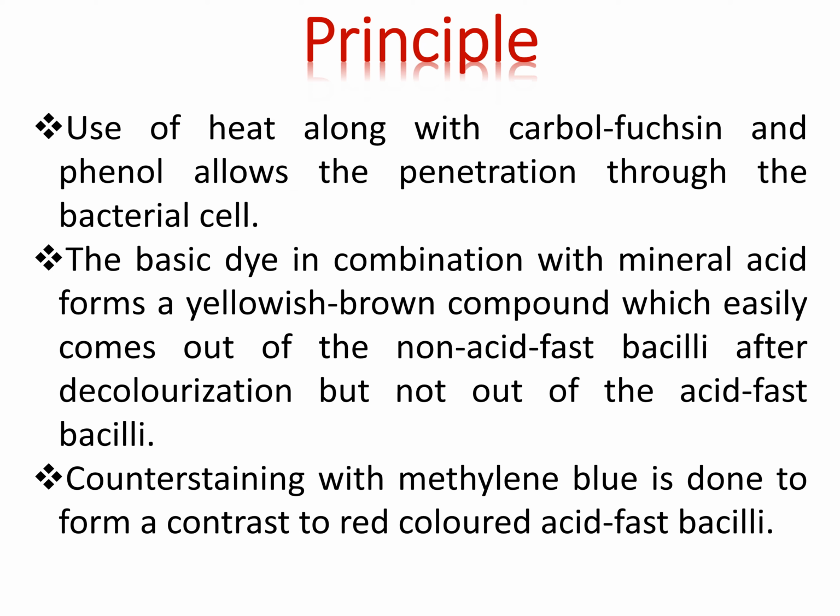The basic dye in combination with mineral acid forms a yellowish brown compound which easily comes out of the non-acid fast bacilli after decolorization, but not out of the acid fast bacilli. Counterstaining with methylene blue is done to form a contrast to the red colored acid fast bacilli.